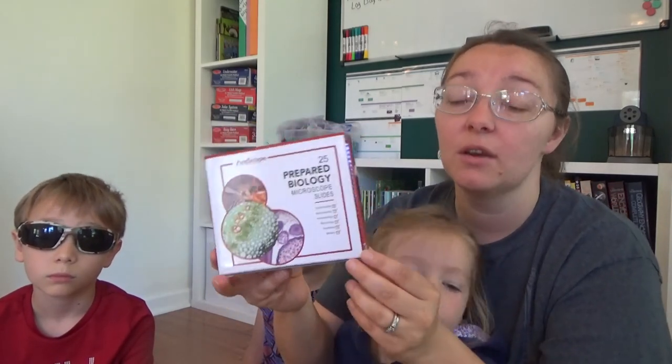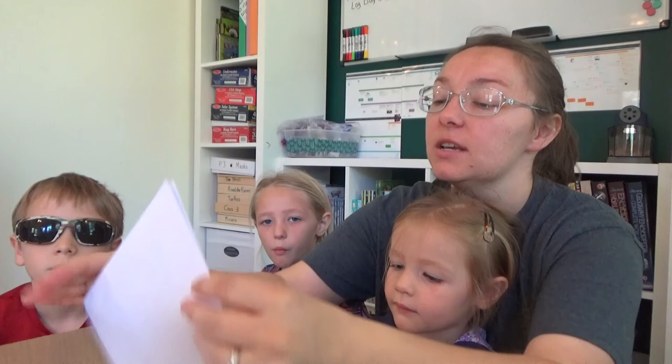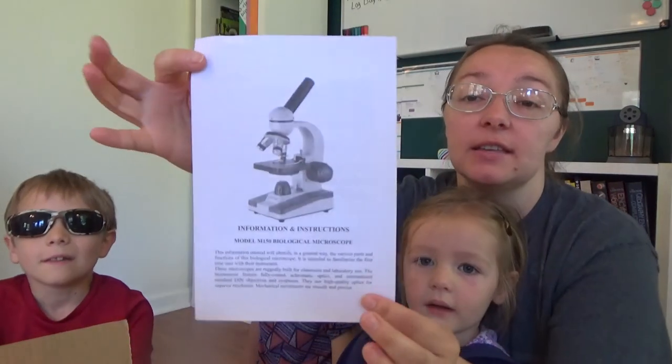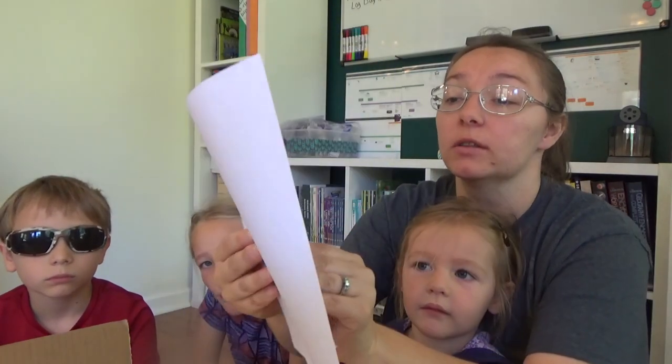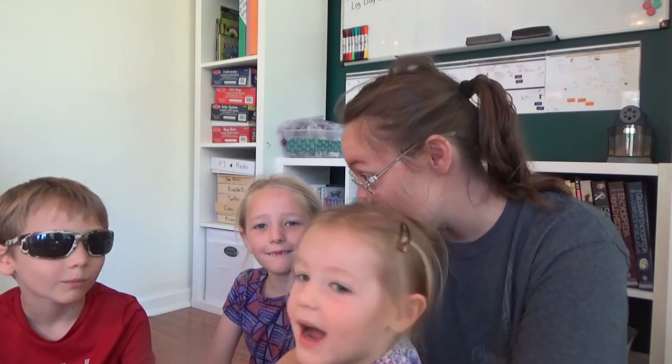So we're going to open up the box. I've already cut the tape because with miss grabby hands here I cannot have scissors around. The first thing you see is the instruction manual — it's just a piece of paper folded in half, so it's not too overwhelming. Now the moment you guys have been waiting for — are you excited? Yeah? Okay, here we go!